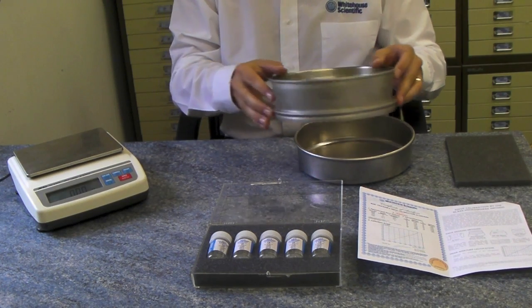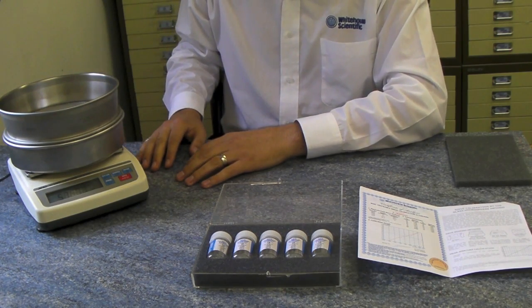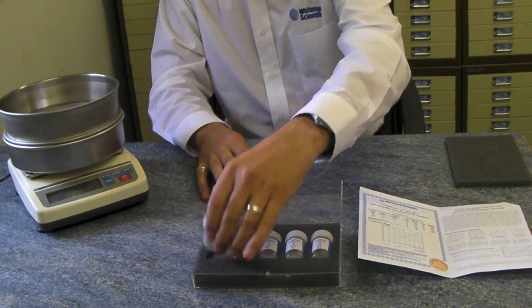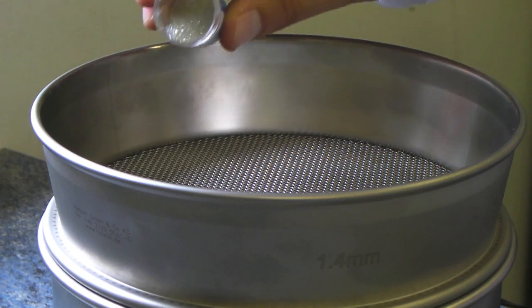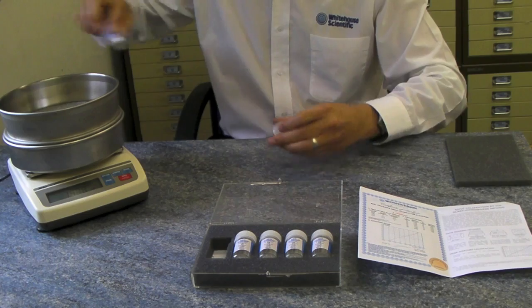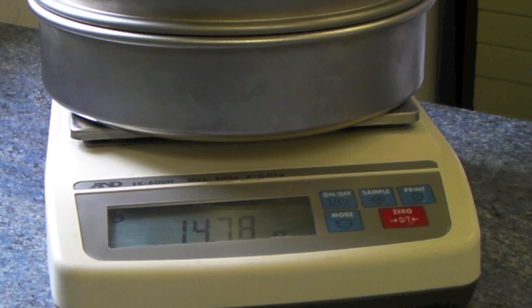To calibrate your sieve, firstly place it onto a sieve pan and onto a balance with a minimum of two decimal places. Ensure the balance is tared at this point. Take one single shot bottle and empty the entire contents onto the sieve surface. Record the initial weight of the standard.